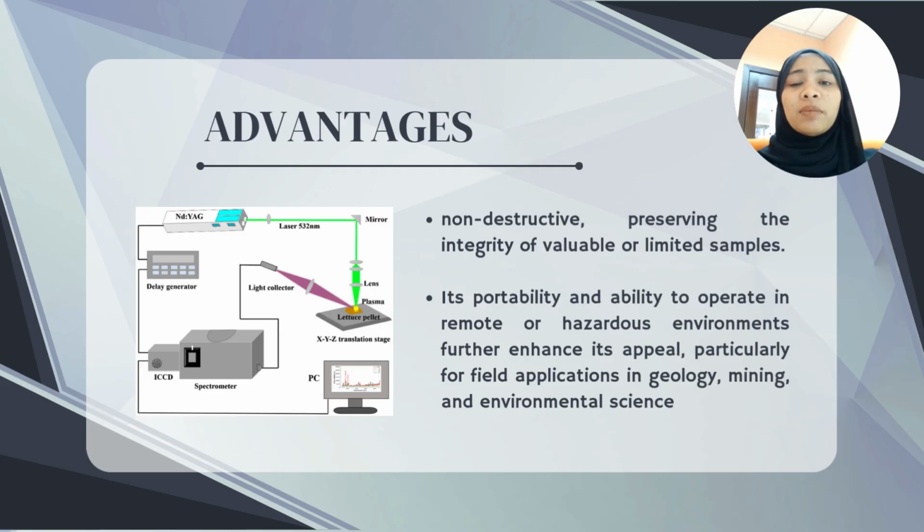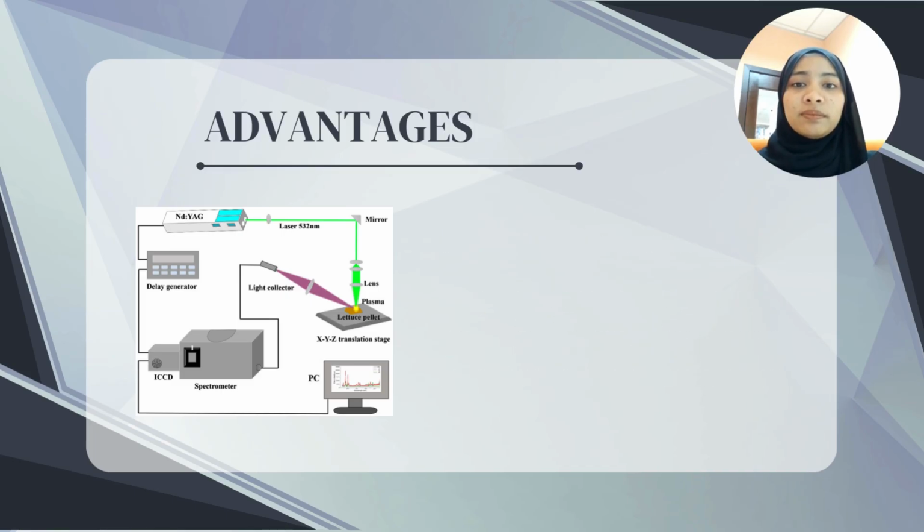Additionally, LIBS is non-destructive, preserving the integrity of a valuable or limited sample. Its portability and ability to operate in remote or hazardous environments further enhance its appeal, particularly for field applications in geology, mining, and environmental science.